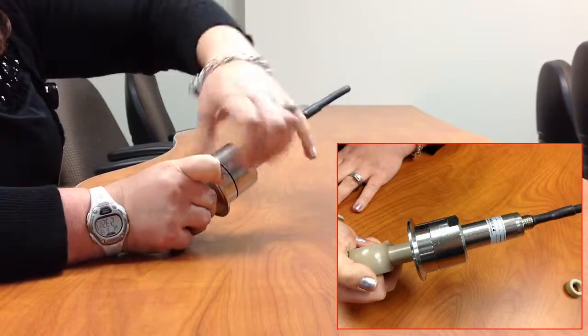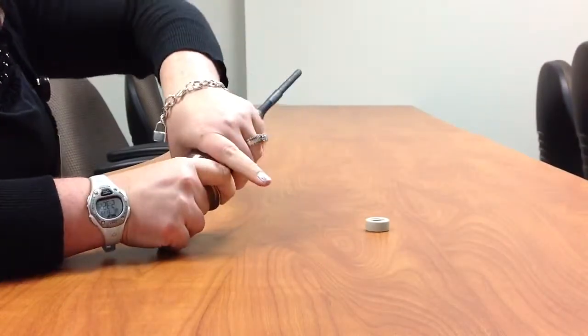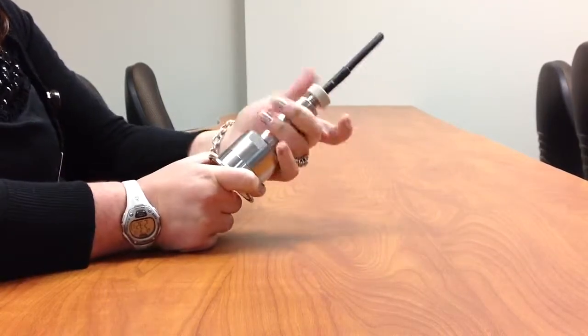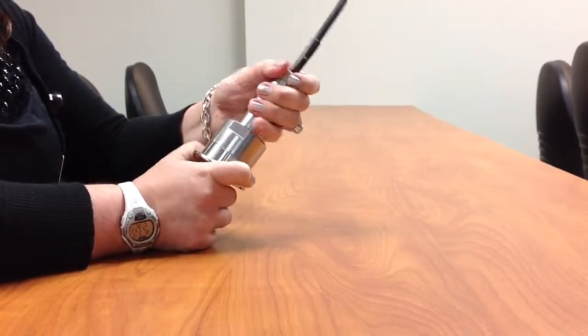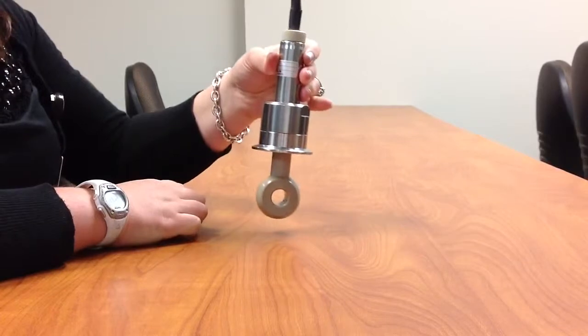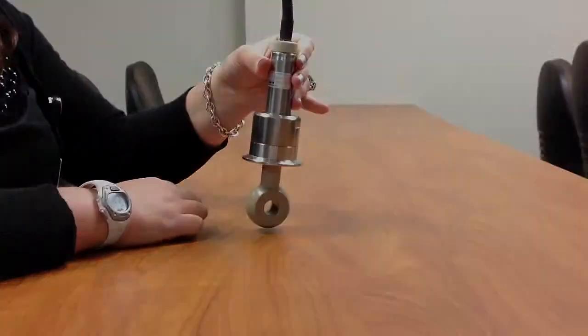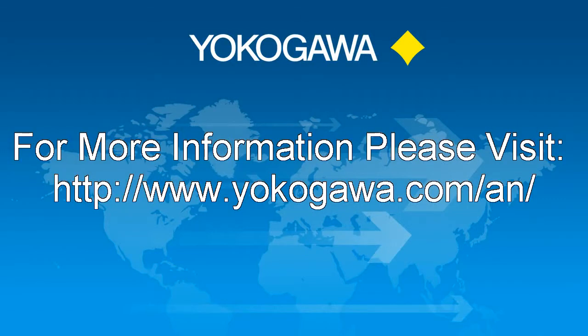Then you thread the last locking nut down. Make sure they're tight. Then the last step is you thread the plastic nut back onto your sensor, and now your sensor's ready for installation into your process. There you go. Thank you.